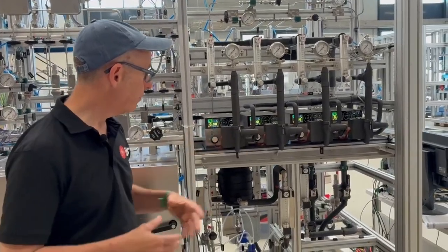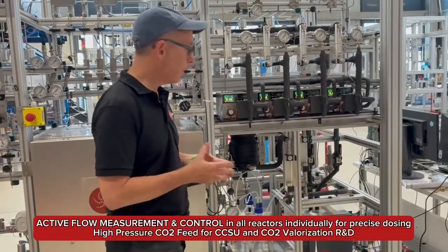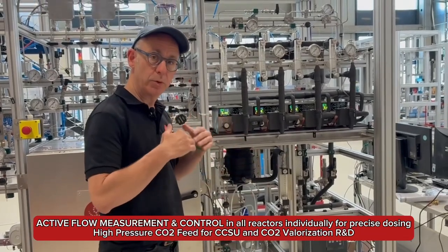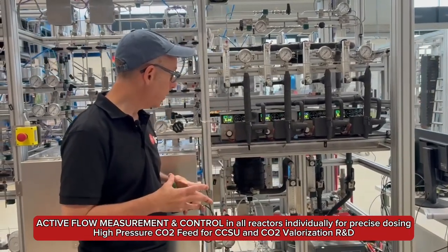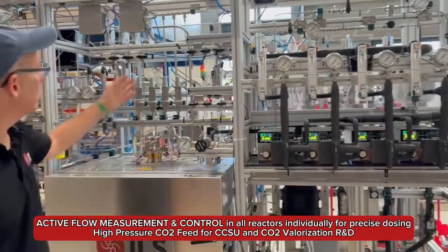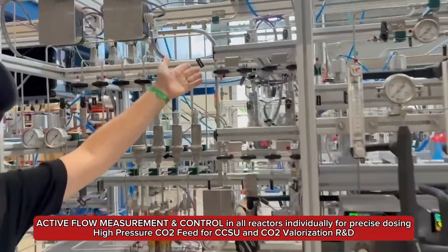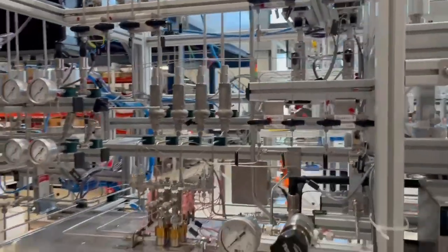For that, we have a series of basically pulsation-free cooled HPLC pumps where we can pull the liquid CO2 via a dip tube out of a feed bottle and pump them individually using HPLC pumps. We're also measuring the CO2 flow using mini Coriolis flow technology, which you see up here, so we really know the exact flow rates of CO2 that are going into each reactor.